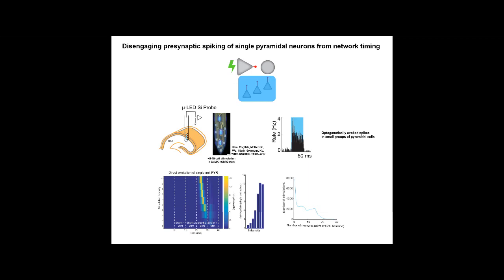You can see what the effect essentially is. This cell is recorded on shank 3, and we did 10 different stimulation intensities. Shining the light on shank 1, shank 2, and shank 4 has very little to no effect. In shank 3, there is a strong effect of the light, making this cell fire more, so the firing rate is increasing, and the latency to spike decreases with increasing intensity, as you would expect for directly depolarizing a neuron such as a pyramidal neuron. The middle plot shows the relationship between intensity and the firing rate gain of these cells. So these are single unit spikes.